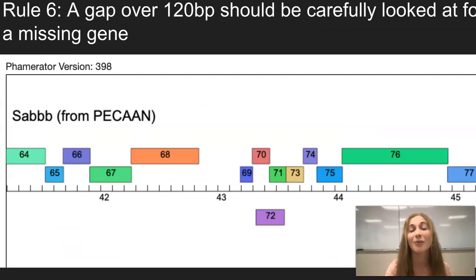Rule number 6 talks about when there's a large gap of over 120 base pairs, it should be carefully looked at for a missing gene. In this example, there is a 355 base pair gap between the gene 68 and 69. And after we look back at it, there actually was a missing gene between the two.